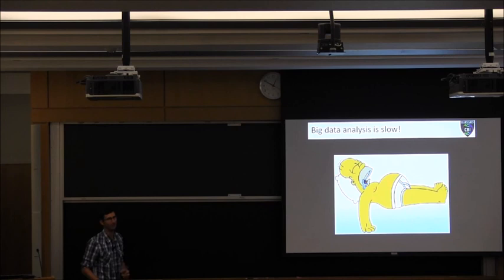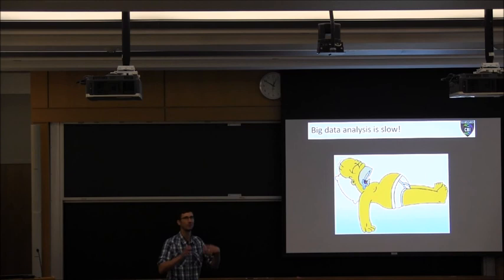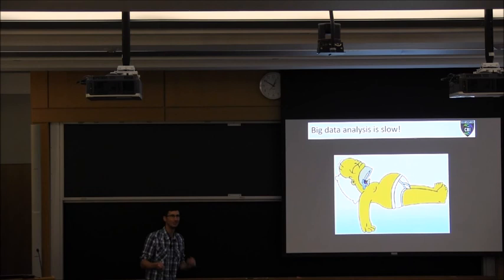The worst part about it is because a lot of what we do in image analysis is iterative, where we'll try something that doesn't work out, we've got to redo that segmentation. Sometimes you let something run overnight, it didn't work, change some variables, have to let it run overnight again. Change variables, have to let it run overnight again.